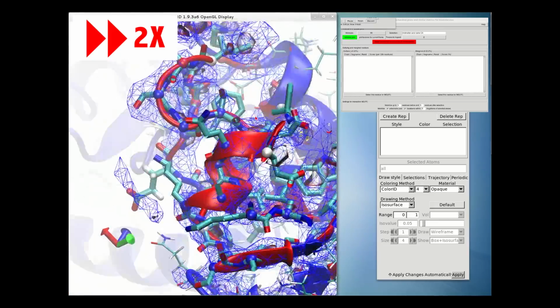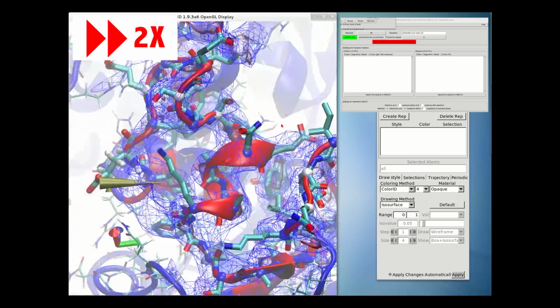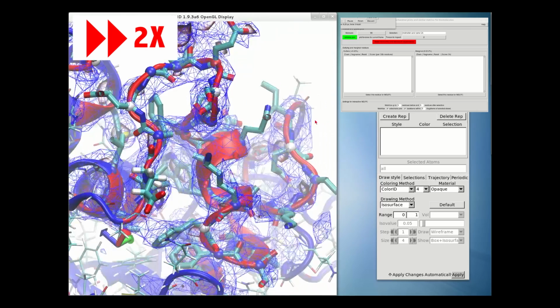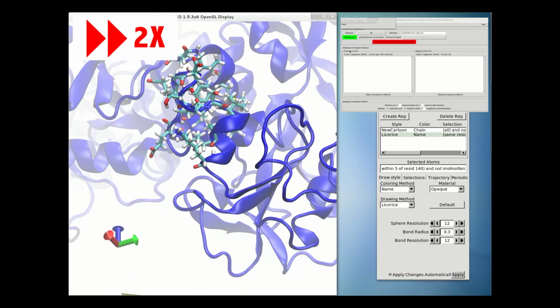I'll then throw out those individual b-factors and run a restrained coordinate refinement with a TLS only b-factor model. I find that in low resolution structures this gives maps that are far more honest in terms of revealing errors.